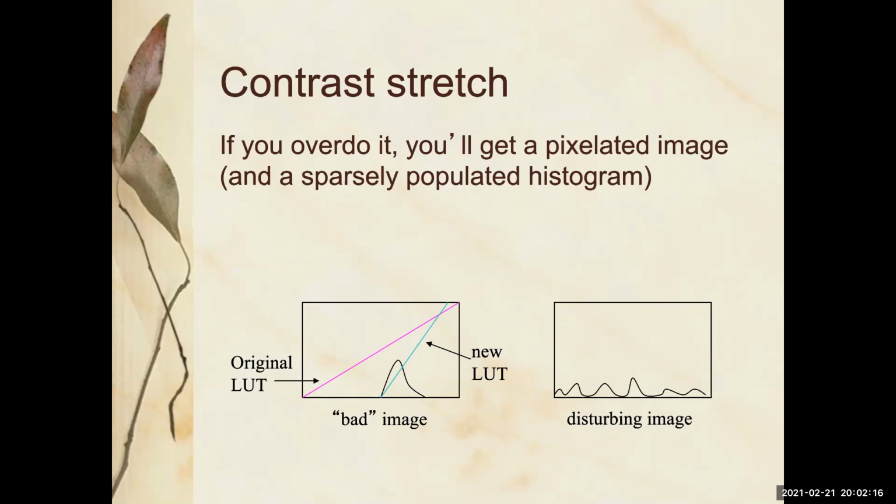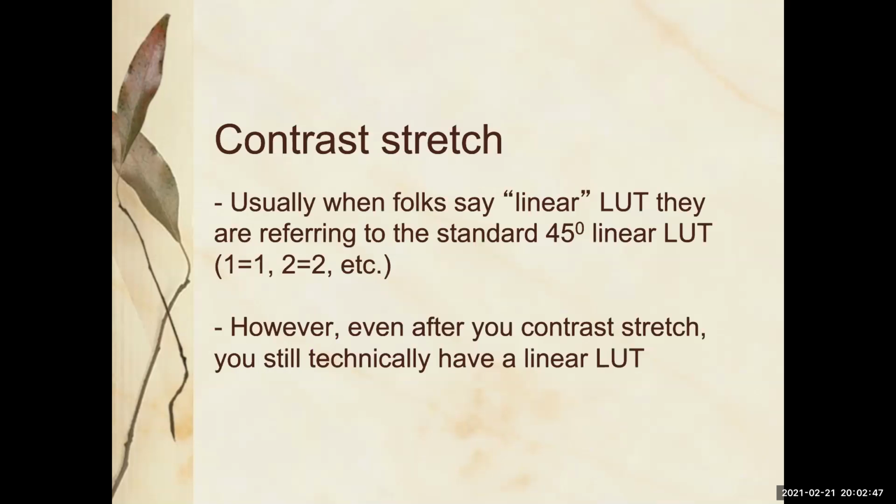You can tell there's no continuity of gray levels in this image. It just jumps and jumps and jumps. And in biology, for most things, there's a continuity to the grays, and so you see a smooth histogram. If you see a choppy histogram, you're like, yeah, somebody over-manipulated this, or maybe contrast stretched it and then got onto a different computer and contrast stretched it more. And it's a mess. Always make a copy before you do anything.